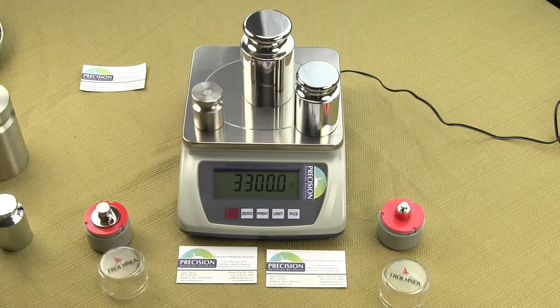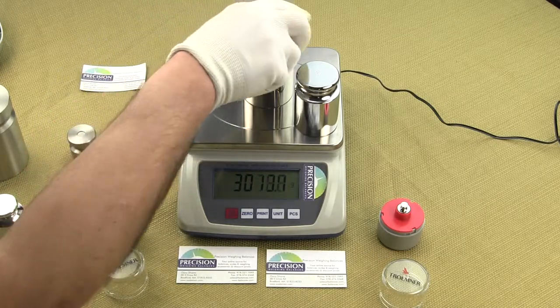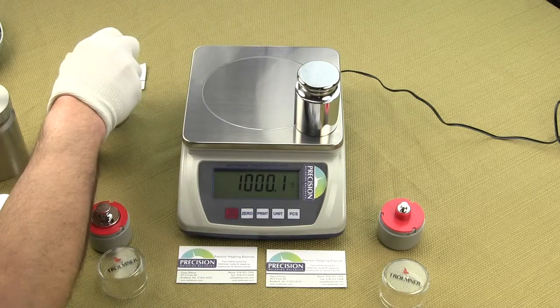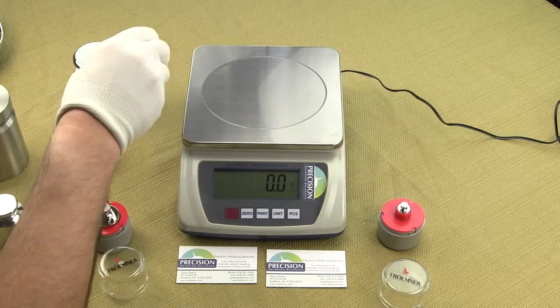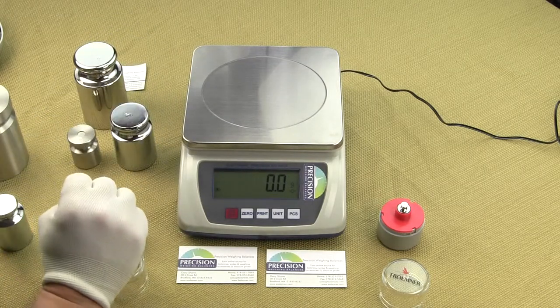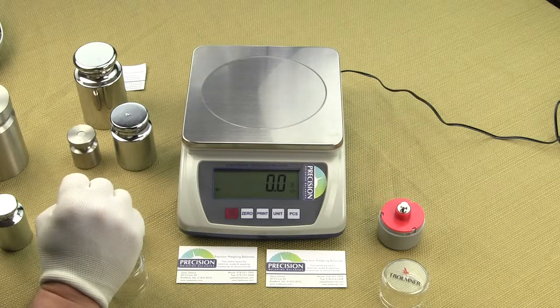The EPB digital scale is lightweight, weighing only 3.1 pounds. It is easy to carry in the field for weighing samples anywhere, anytime. This compact digital scale offers a combination of remarkable features at an affordable price.